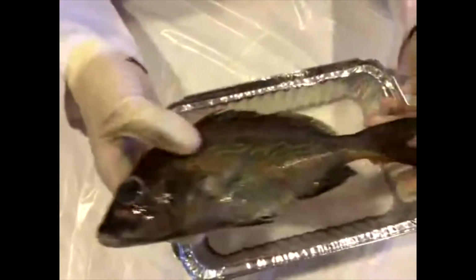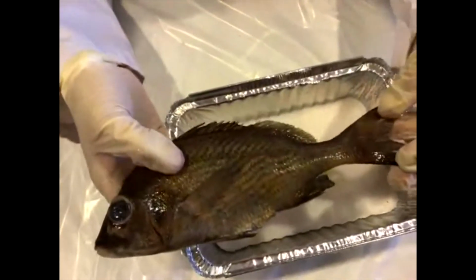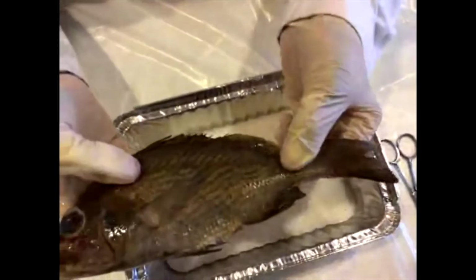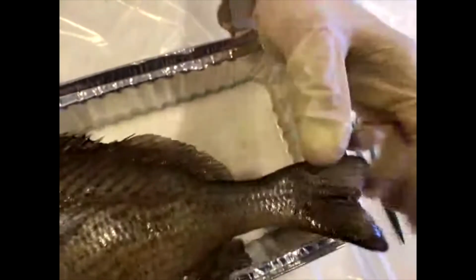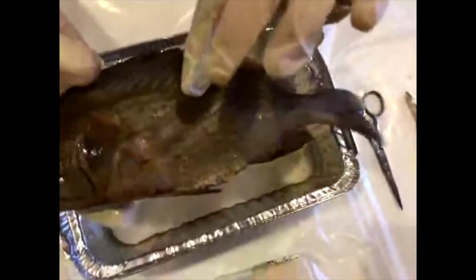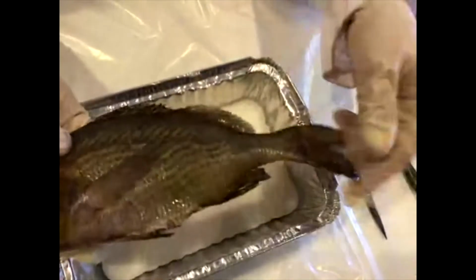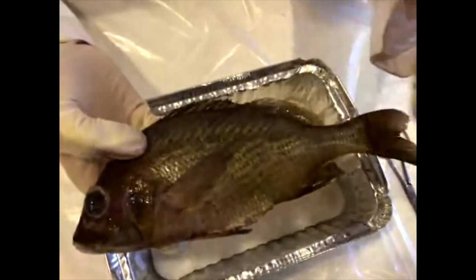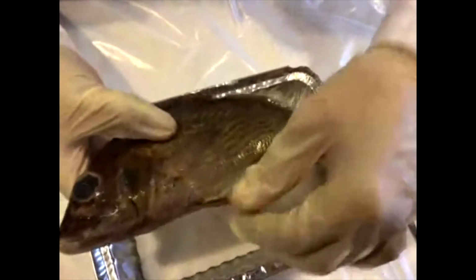And then last but not least, we've got the tail fin, or what we call the caudal fin, and there's quite a bit of muscle here. And so this is the strongest fin, and it's actually used to propel the fish. So this is what makes it move fast. And then these fins down here are for steering, and this fin here is for balance. So if you haven't already started, draw the rays into your fins, and remember that they're bony fish.